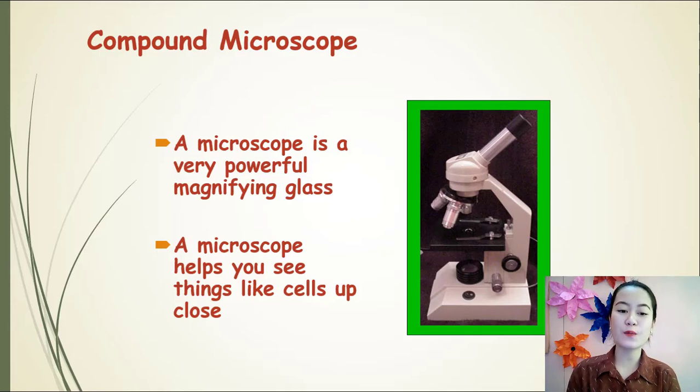So a microscope helps you see things like cells up close. So yung mga specimen, meron tayong mga specimen ngayon na nilalagay sa sliding glass para makita natin yung hitsura niya under the microscope.